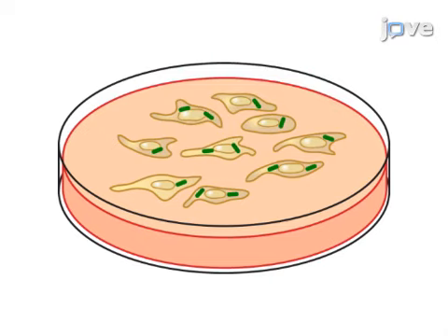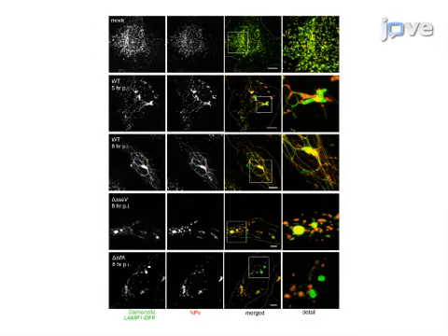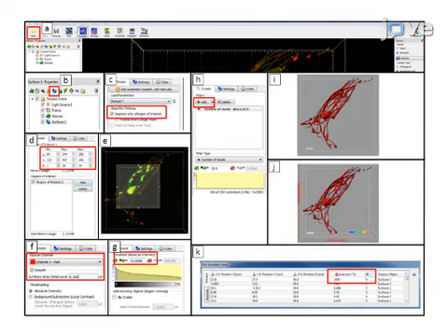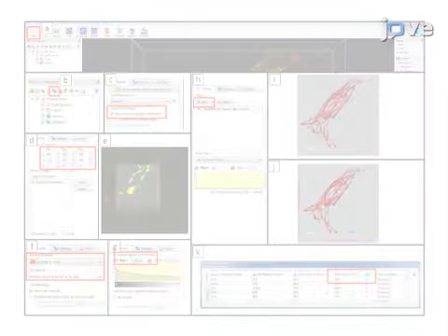Next, a pulse trace labeling of infected host cells is performed by incubation with gold BSA rhodamine nanoparticles. The final step is to observe alterations of the host cell endo-lysosomal system by confocal microscopy. Ultimately, quantification of the intracellular distribution of nanoparticles is performed using the Imaris software package.